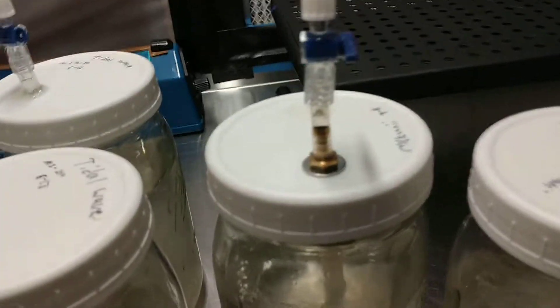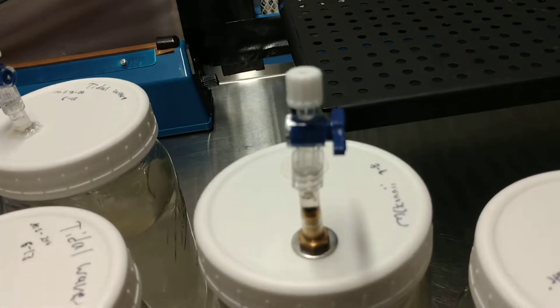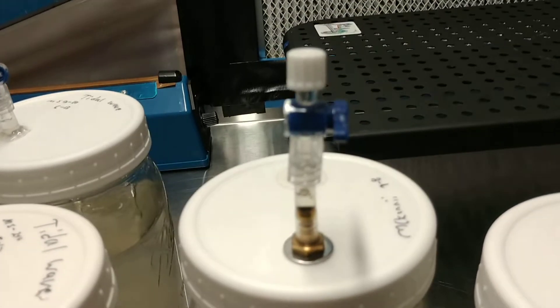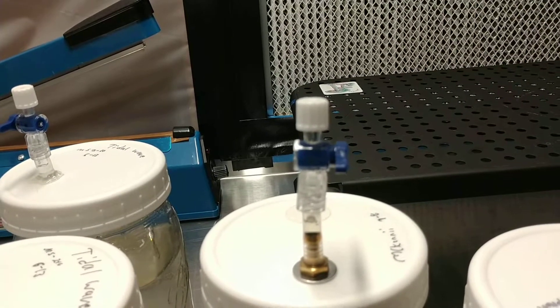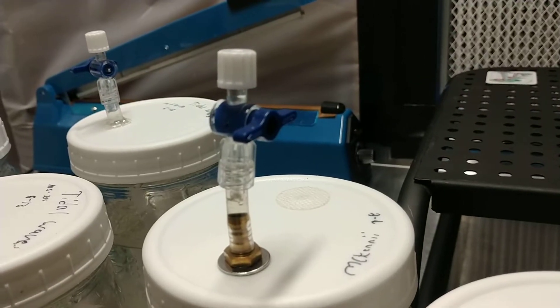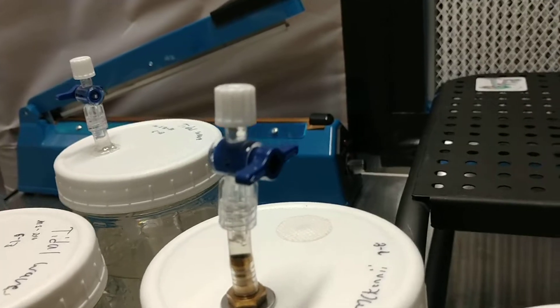So this is a lid we use. This allows you to draw out of it without sticking a needle into it. You just put the syringe on the top, turn the valve, pull it out, close the valve, you're done.